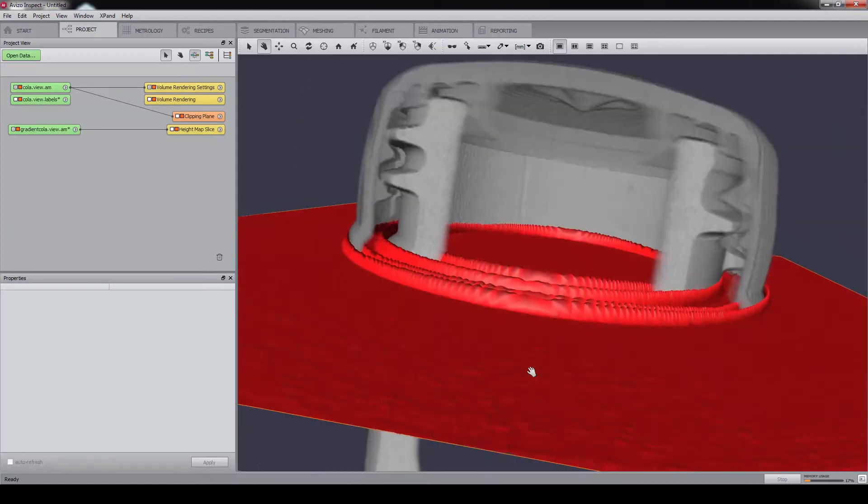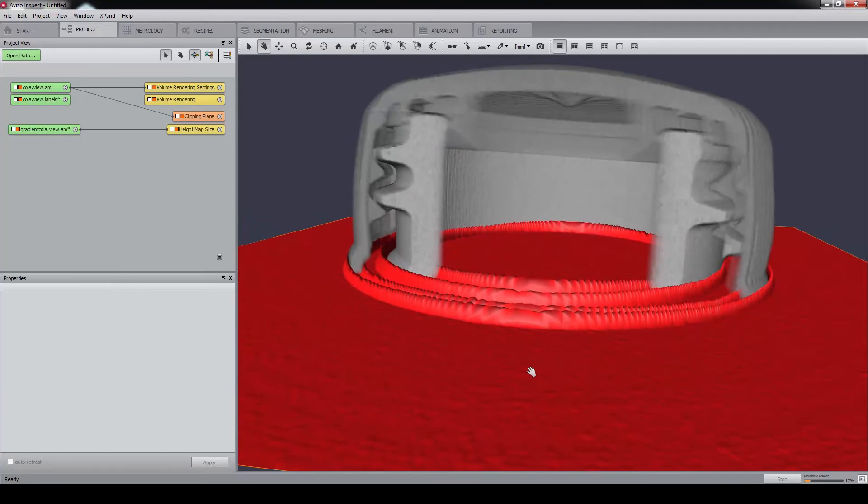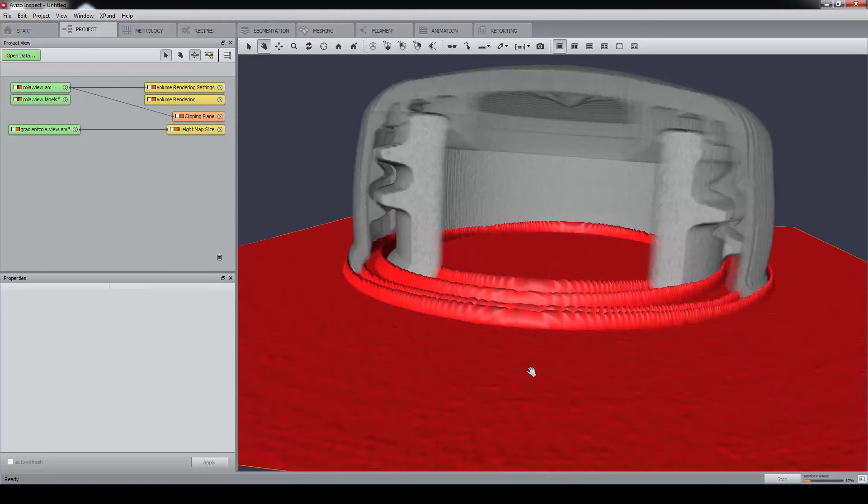The watershed algorithm simulates the progressive immersion of a landscape, starting from a set of labeled regions. The labels we have defined will be used as seed markers for watershed expansion. A virtual fluid fills the basins defined by the gradient magnitude until the liquids meet at the watershed lines.